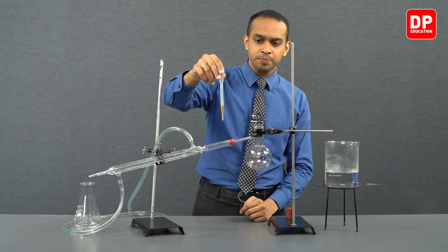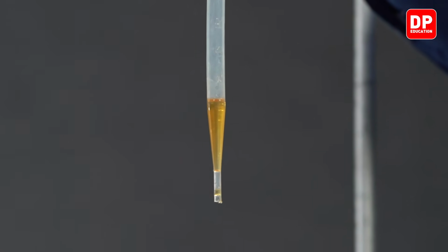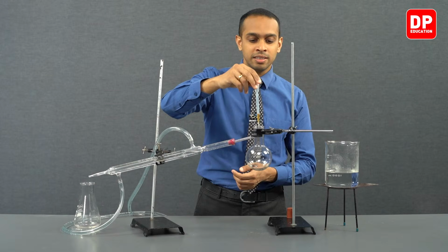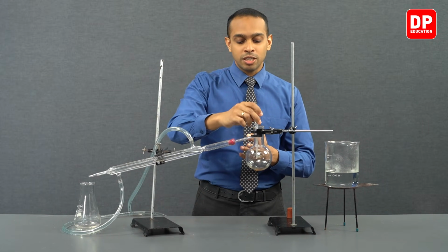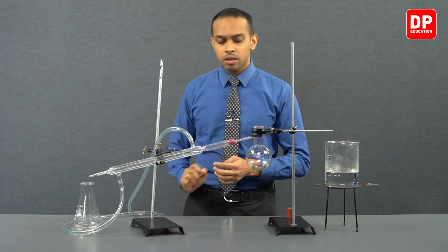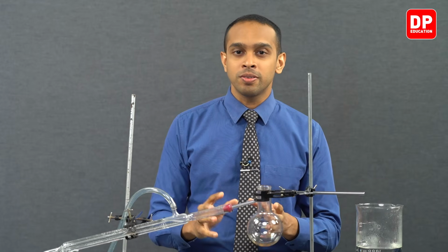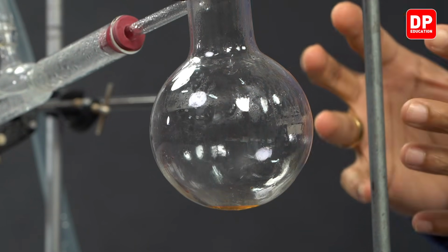So we can see here, this is the amount of essential oil that we extracted. And right now, the entire area is surrounded with the pleasant smell, or pleasant odor, coming from this essential oil. So we have now extracted a small portion of cinnamon leaf oil, or in other words, eugenol essential oil.